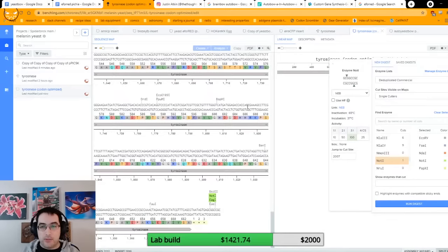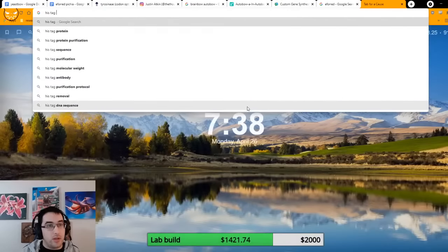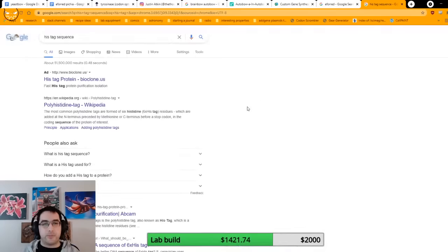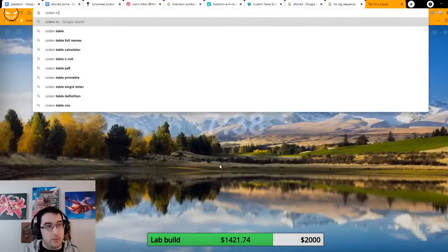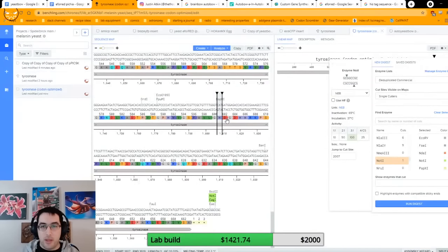Now I need a His tag. His tag sequence. It's 6 of them. Okay, cool. So I need 6 histidines, which are these. So let's go to the codon table. You know what? I'm just going to copy them out of here. So let's grab this, copy 1, paste, paste. Then I've got 2 here, so I'm going to copy. My goal here is to get 6.